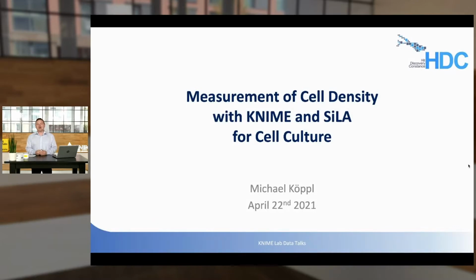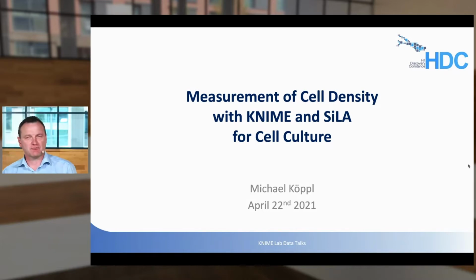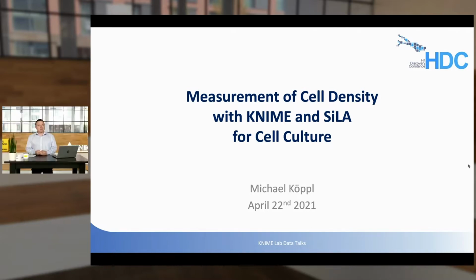Okay, so in my talk, I will talk about the measurement of cell density with Knime and SiLA for cell culture. More or less, this will be the motivation or explanation for what you saw earlier, what Rob presented, and also what Patrick presented. So why we did this, how we did this, and what the goal is.